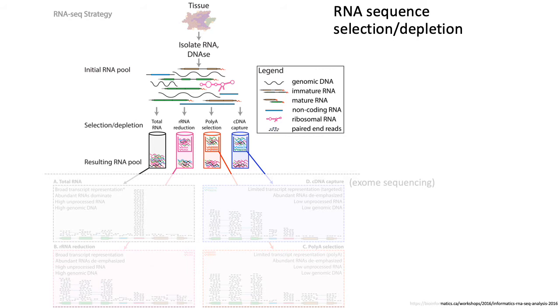On the other hand, there are also some practical considerations. So, for example, for samples that are fixed, right? So those are FFPE samples, for example. A lot of times, FFPE basically causes a large degradation of RNA in your samples. And so oftentimes, you can't actually just do general poly-A selection because your RNA is just too degraded. And so oftentimes then you might switch to a selection strategy like exome capture, which is more targeted and can therefore more easily pick up specific targeted genes that you're interested in.